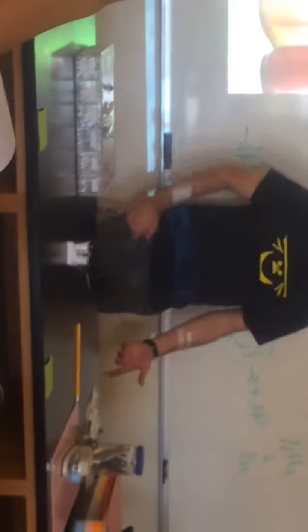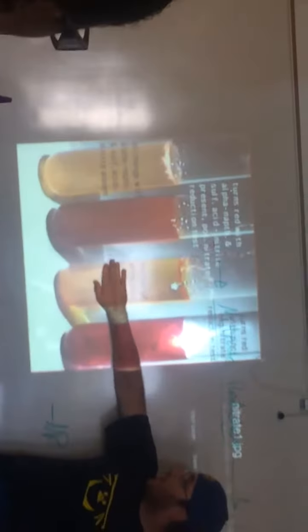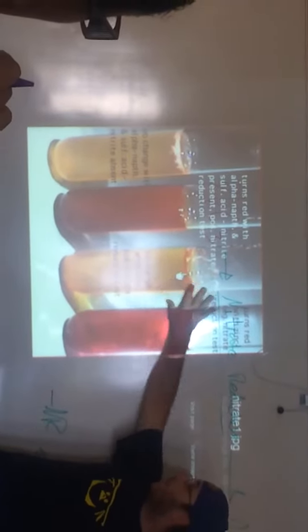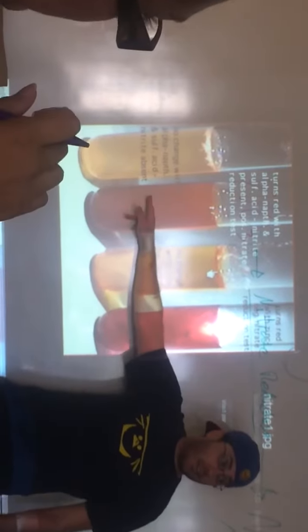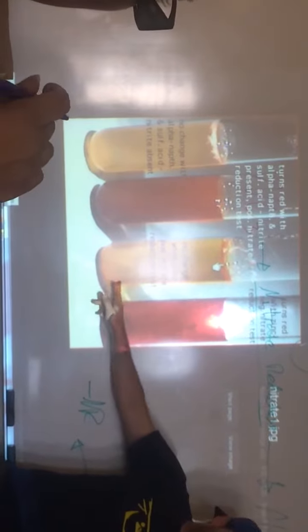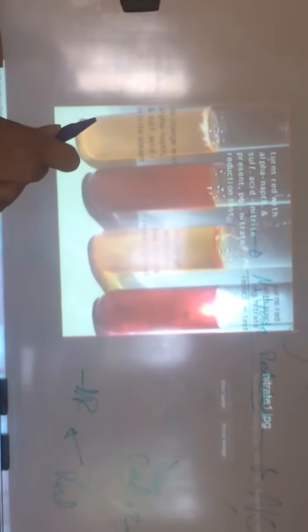Yeah, exactly. You need to be able to do that in 90 seconds. Sometimes I've just done the picture because we've gone over it: if there's no color change, then you add this. So I've done it with just the picture and no words before too. That could be a PowerPoint question.